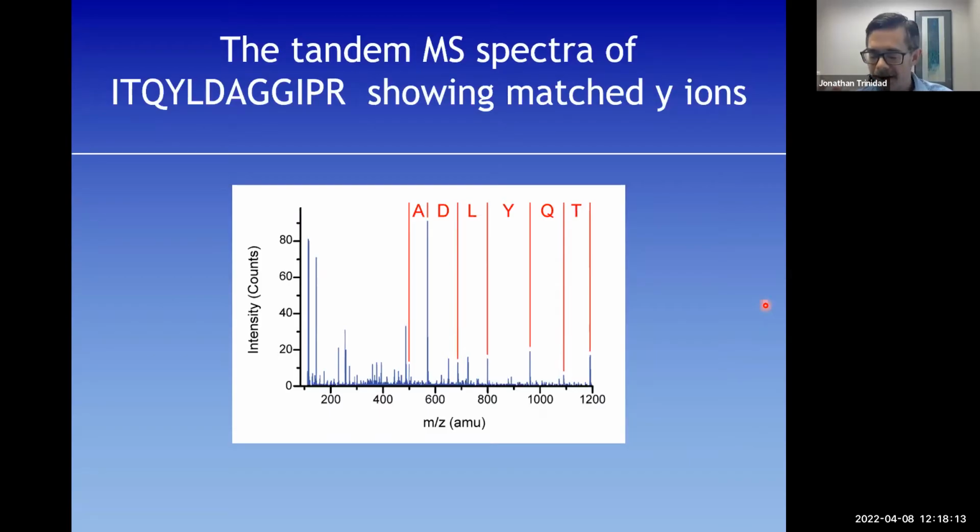It ranks them by their theoretical mass. What's not shown here is the MS1 data used to trigger this MS2 acquisition, but from the MS1 data, we'll know the mass of the precursor, within a couple parts per million. We basically just then go to that list. We look at the maybe 50 or so peptides that are close enough in theoretical mass to our observed mass. And we say, okay, these are our 50 candidates.